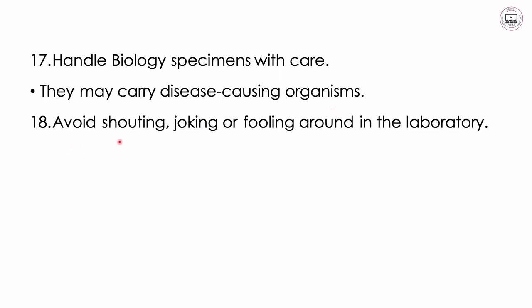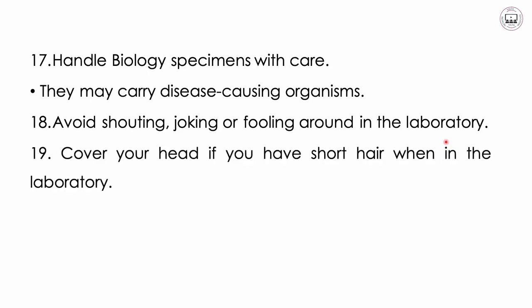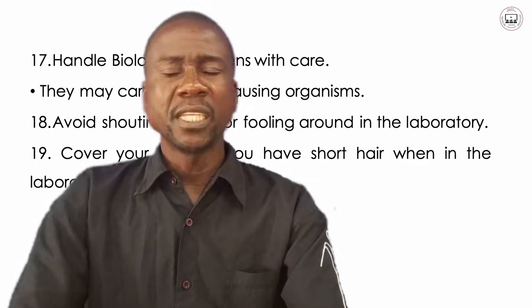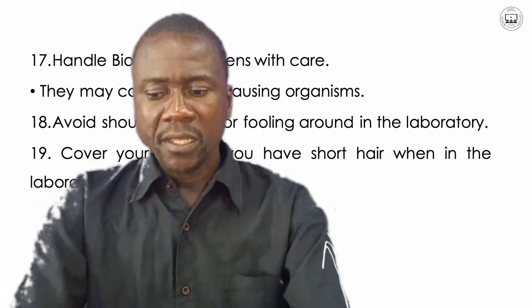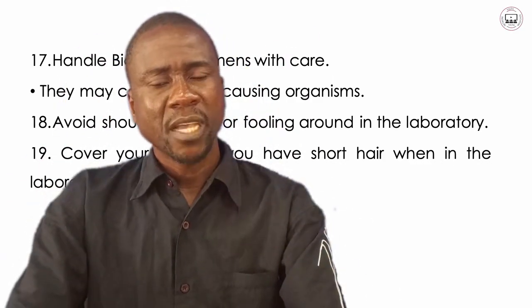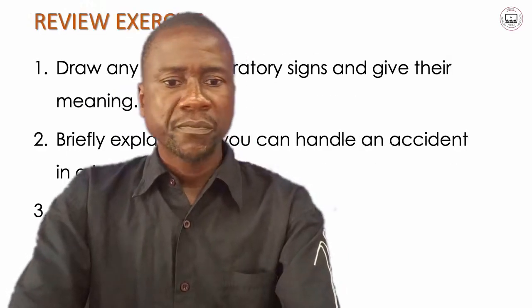Then 18, avoid shouting, joking, or fooling around in the laboratory. As you do an experiment, or you join the laboratory, you are supposed to be quiet as you do your experiment. 19, cover your head if you have short hair when in the laboratory. Most of the people in the laboratory wear something covering their hair. Why? Some of the hair might fall on the experimental objects.